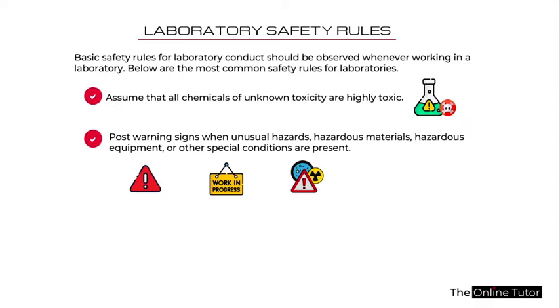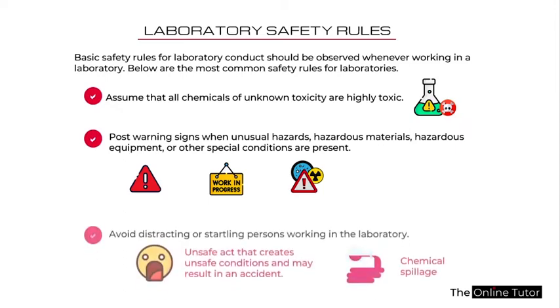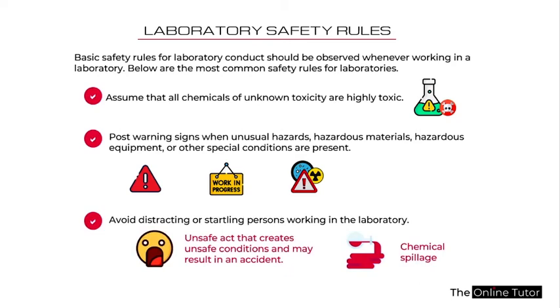So you post warning signs to caution people not to come close to your setup when you are not around. Post warning signs to alert people not to be exposed to any hazardous chemicals or substances around you. You also have to avoid distracting or startling persons working in the laboratory. This is very, very important.